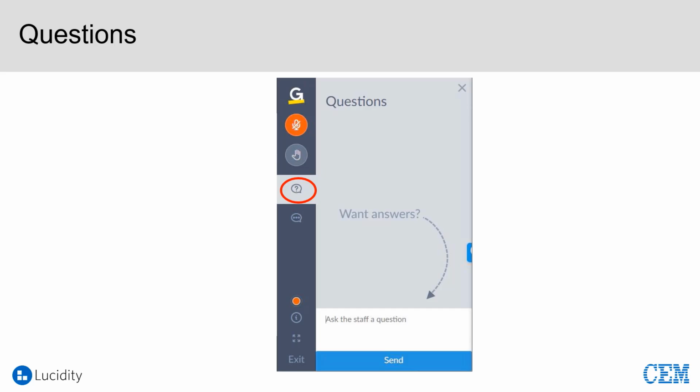Gotcha. No, that's fascinating. I did not know you could inject water on a GC column. So I'm even learning things today. Well, you can. You've got to be a little careful, and a lot of the column vendors don't want to admit it, but you can. Good to know. Give it a try. Again, be a good scientist. Try it and see, and you'll have to see how it works for you in your own context, or not.